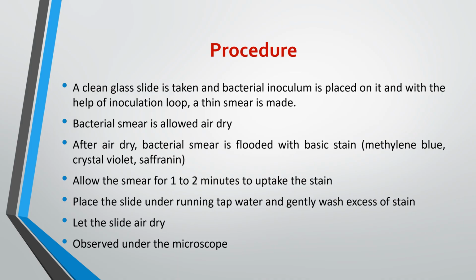After air drying, the smear is flooded with a basic stain such as methylene blue, crystal violet or safranin. Allow the smear 1 to 2 minutes to take up the stain. After that, place the slide under running tap water and gently wash off the excess stain. Let the slide air dry and observe under the microscope.